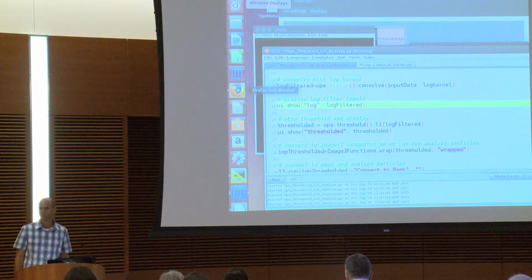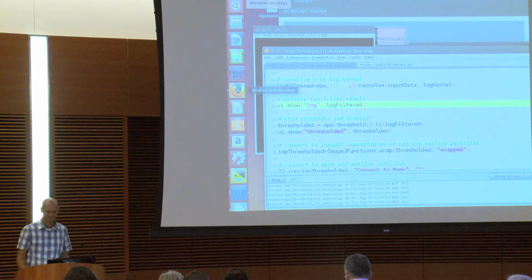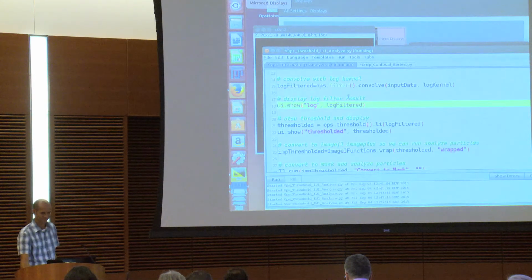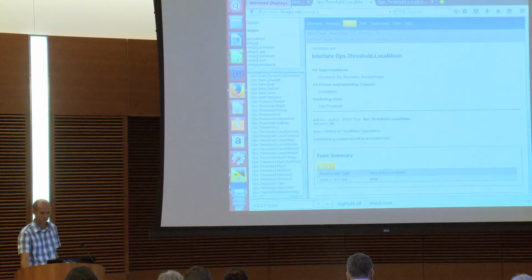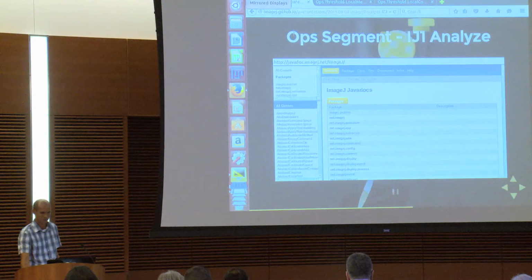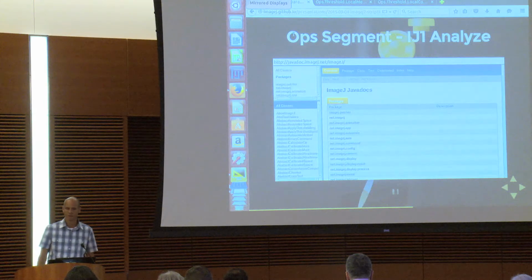So doing that will be easy, in quotes. Might work already, but we have no examples. We'll get to a script that shows that in code, like having an op that uses another op internally. It's quite nice.